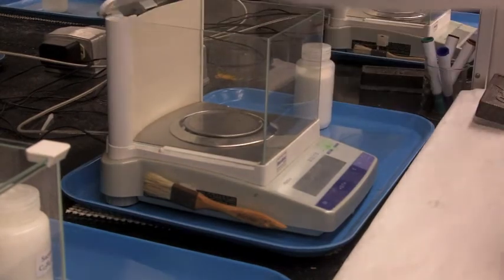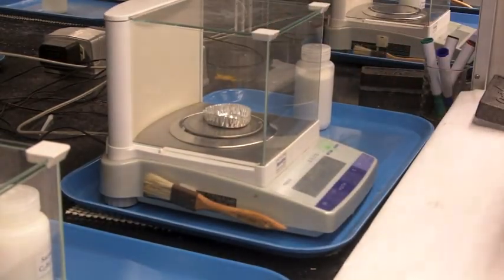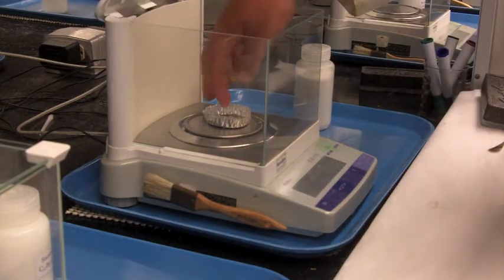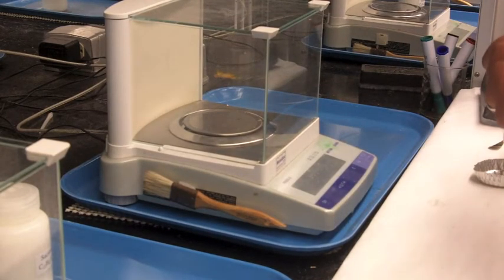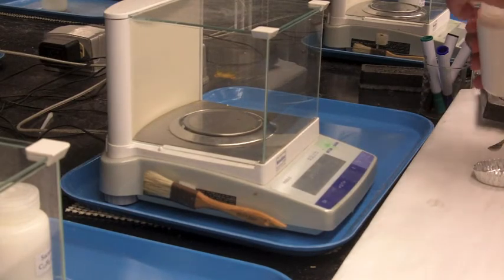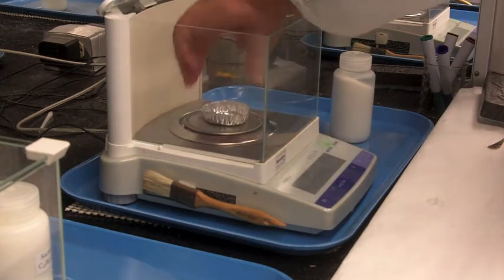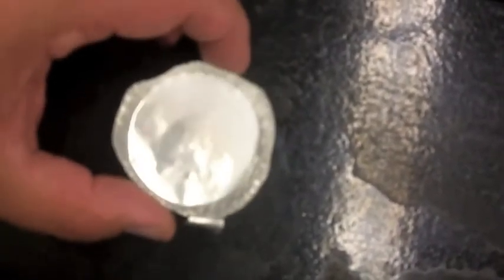The experiment itself is pretty straightforward. So you're going to get a mass of these aluminum pans, and after you get the mass of the aluminum pan you can then add a certain amount of bicarb. There will be two mixtures there, just pick one of them. There will be two unknowns, they will have different ratios of sodium bicarbonate and sodium chloride. So you'll use those mixtures and you can weigh that out. It should be somewhere in the gram range that goes into the pan, so you'll have mass in the pan.